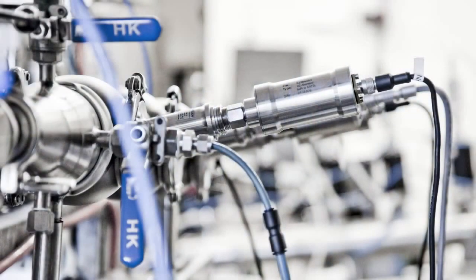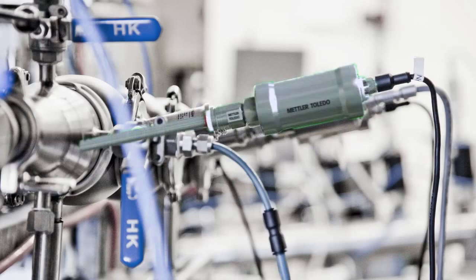At the tip of the sensor, there is a layer of molecules that absorb and emit light. These molecules are sensitive to oxygen, which alters how the molecules behave. The greater the quantity of oxygen, the greater the changes in their behaviour.